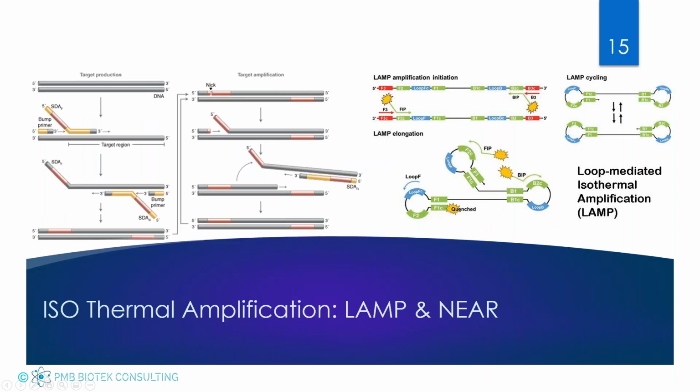Conversely, when we talk about isothermal amplification, what we're using is proprietary enzymes that will either nick, which is used in NEAR technology, or essentially cleave the DNA in certain instances so that we can perform our amplification at a single temperature.